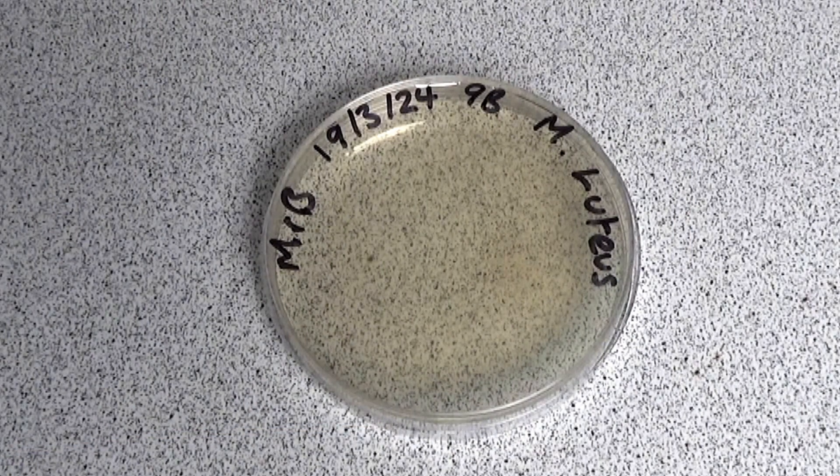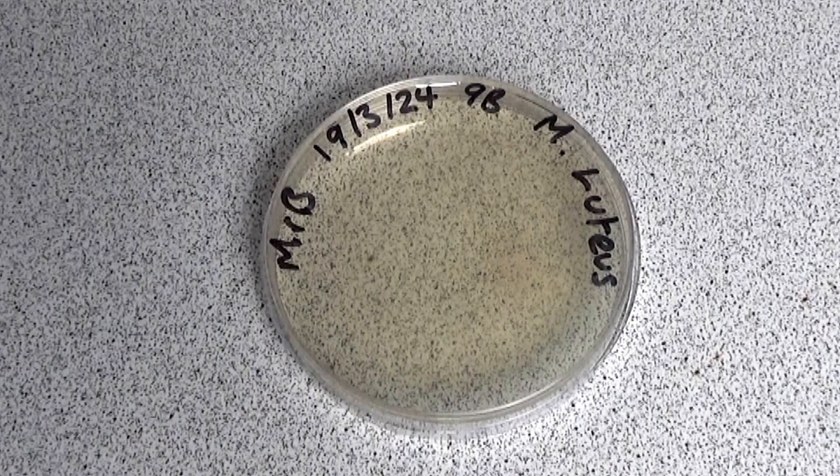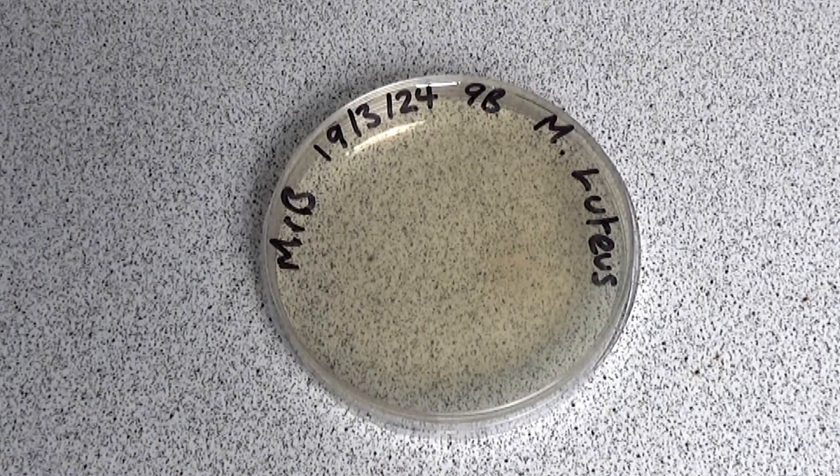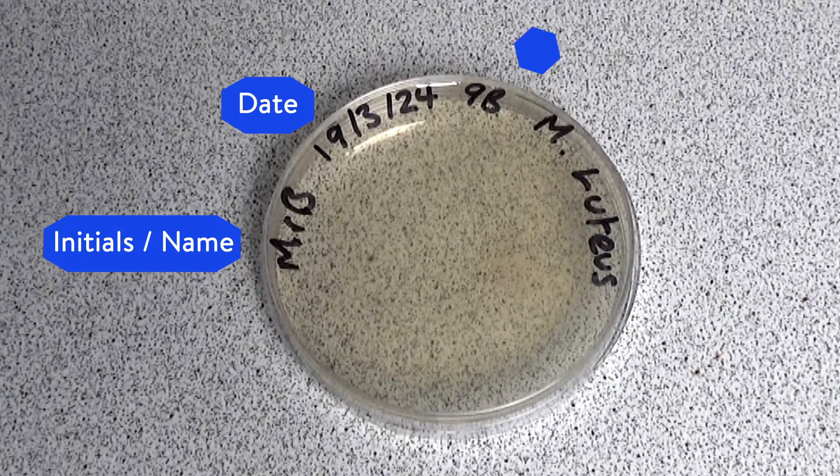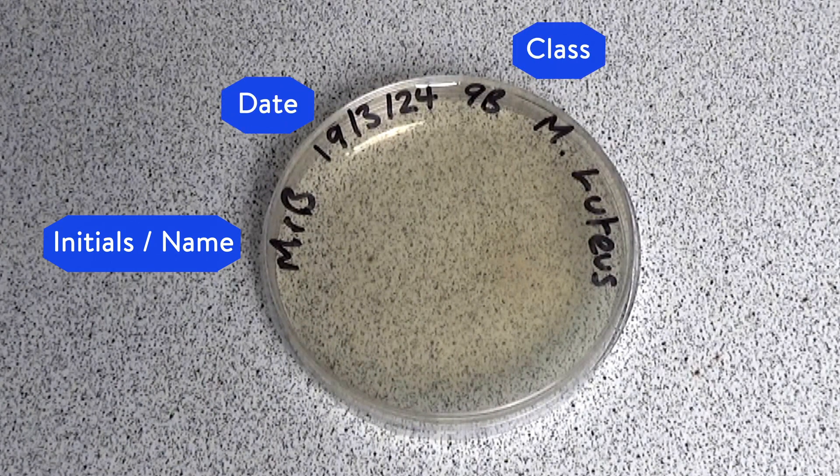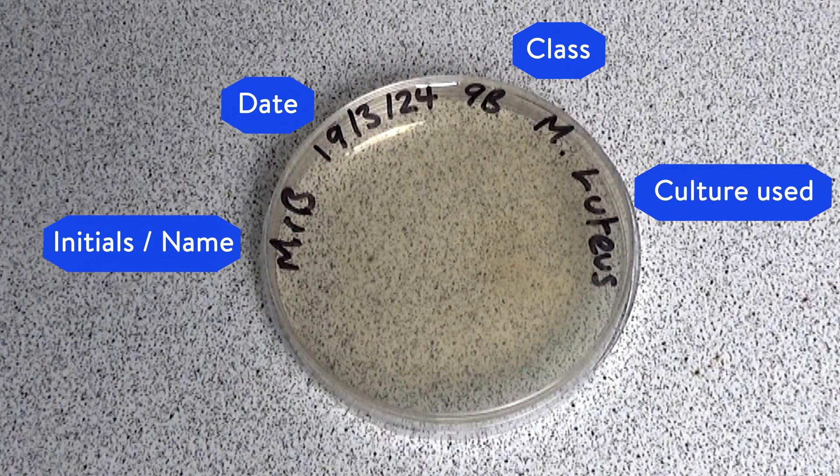Your students then label the underside of the petri dish containing the nutrient agar, making sure they write around the edge of the dish. They need to put on their initials or name, the date, their class to help the technicians when it comes to storing the dishes, and also the culture that they've used in the dish.